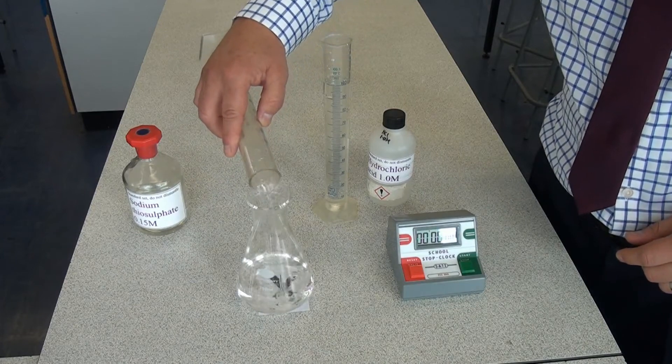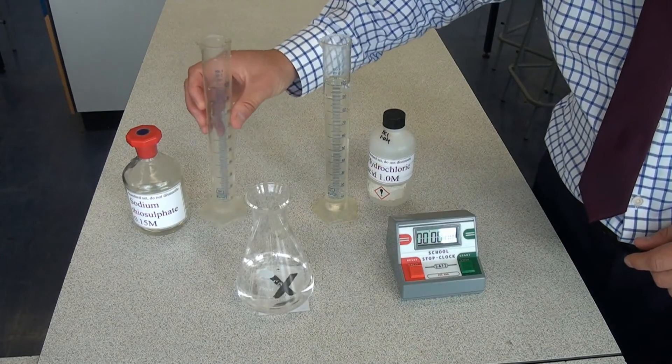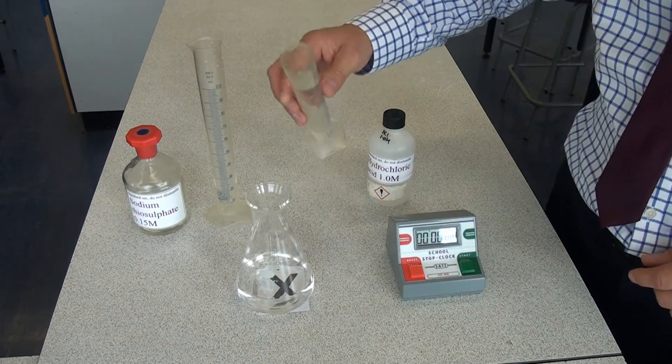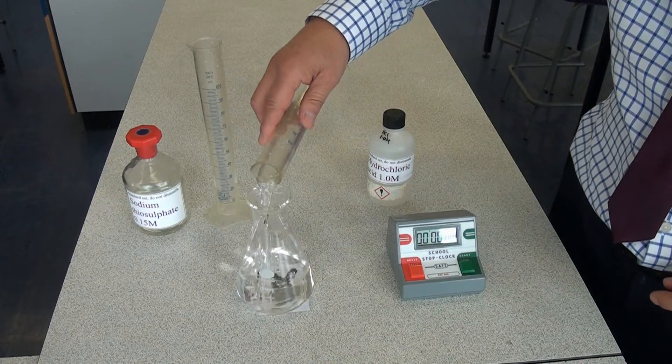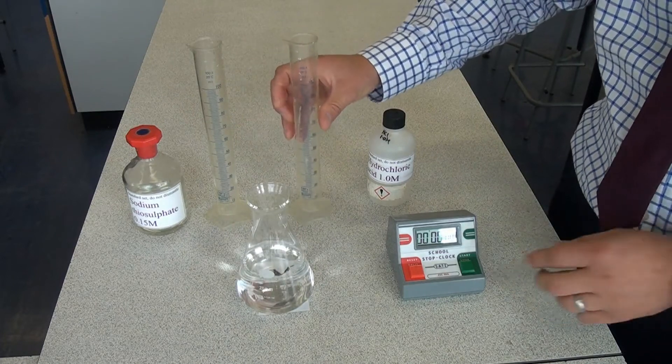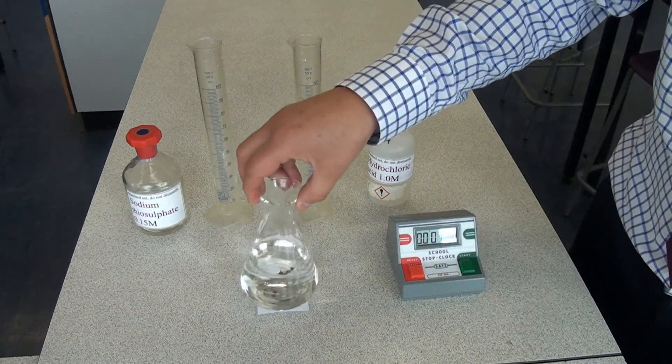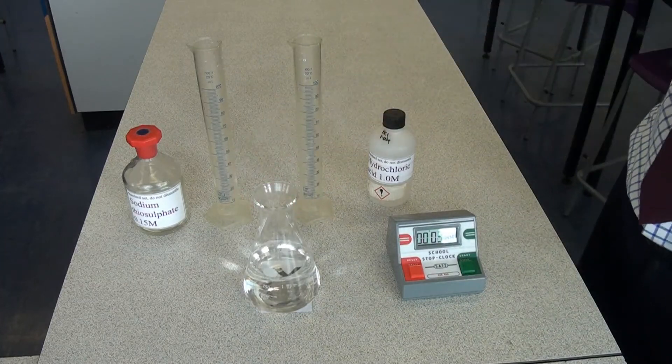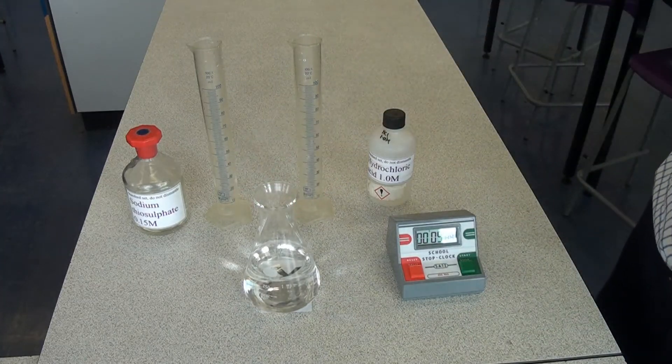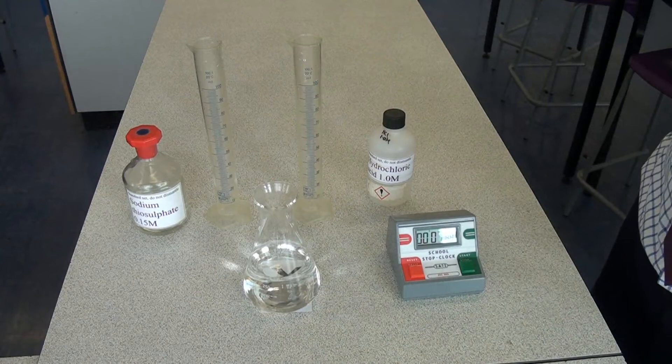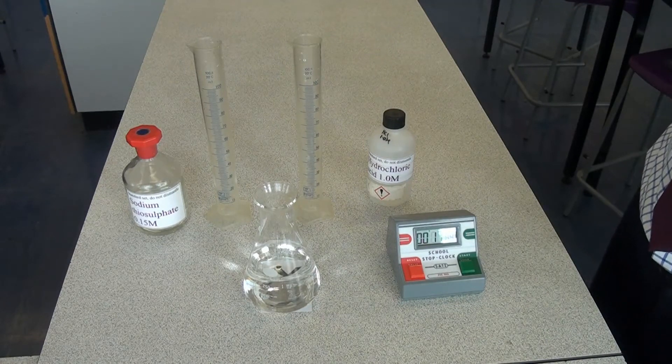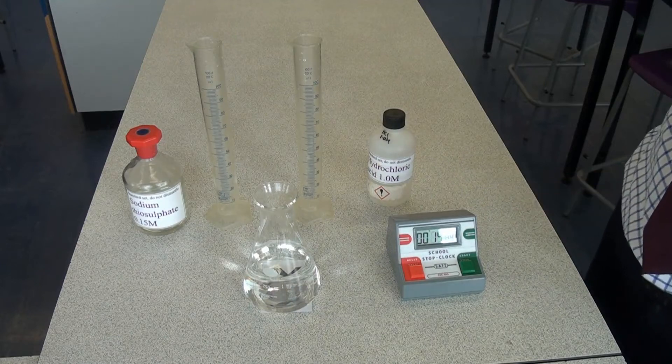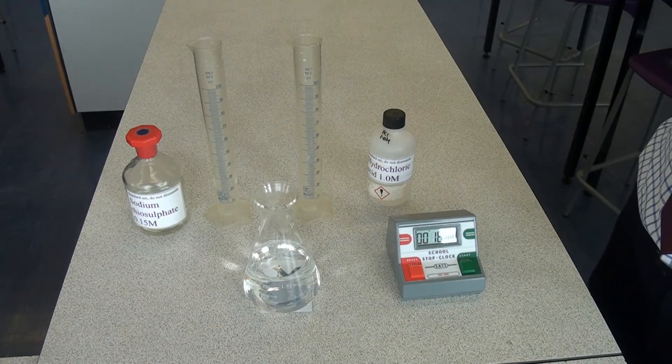And then as I pour the second reactant in, I'm going to start the stopwatch. Now, as the solid is produced, those tiny particles of solid will make the solution go cloudy. And so what we're going to do is time it until we can no longer see the cross through the reactants. Now, where we've got two liquids like this producing a solid, we call that solid a precipitate.